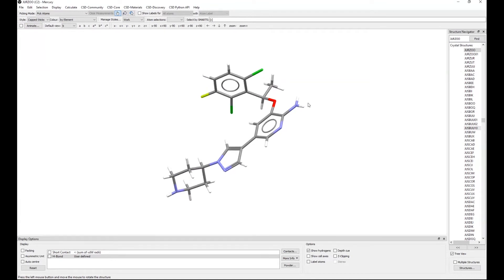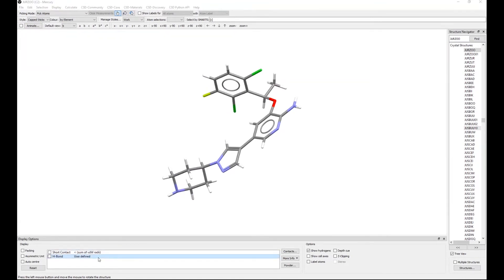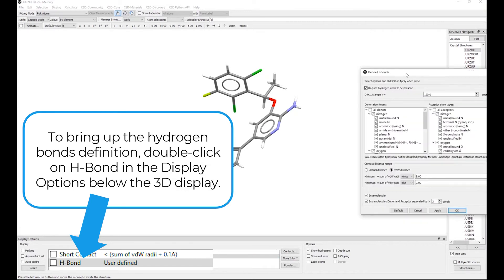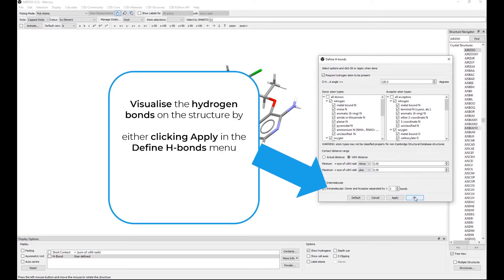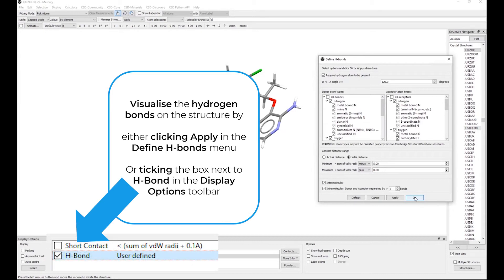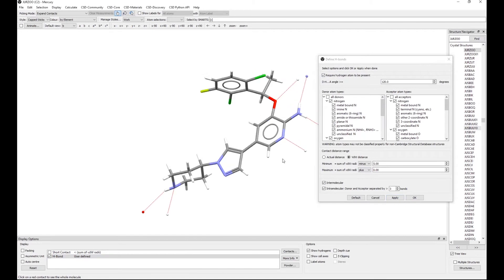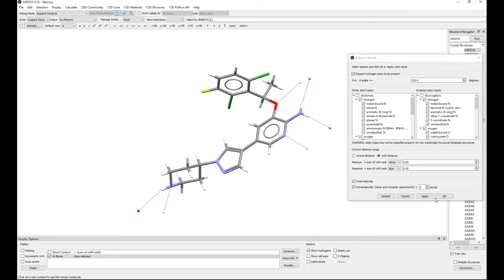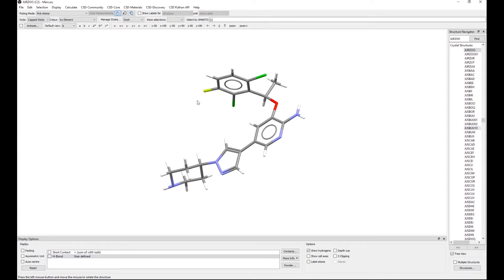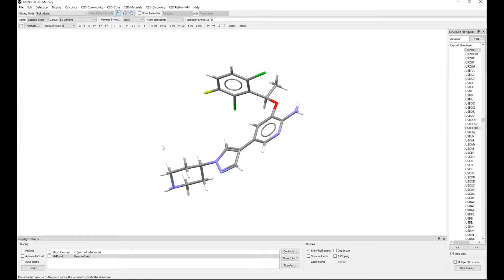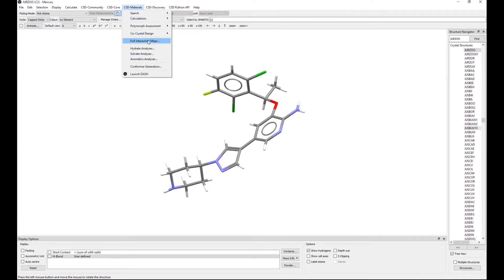This is crizotinib, the molecule we will return to shortly. First, I want to show my hydrogen bonds definition — I've made sure that I only want a hydrogen atom to be present on my molecule; everything else is set to default. Full interaction maps will be generated for everything you have in the visualizer unless you select otherwise, so I'm turning off the hanging contacts to avoid generating additional unwanted full interaction maps. I then go to the CSD Materials menu and select Full Interaction Maps.